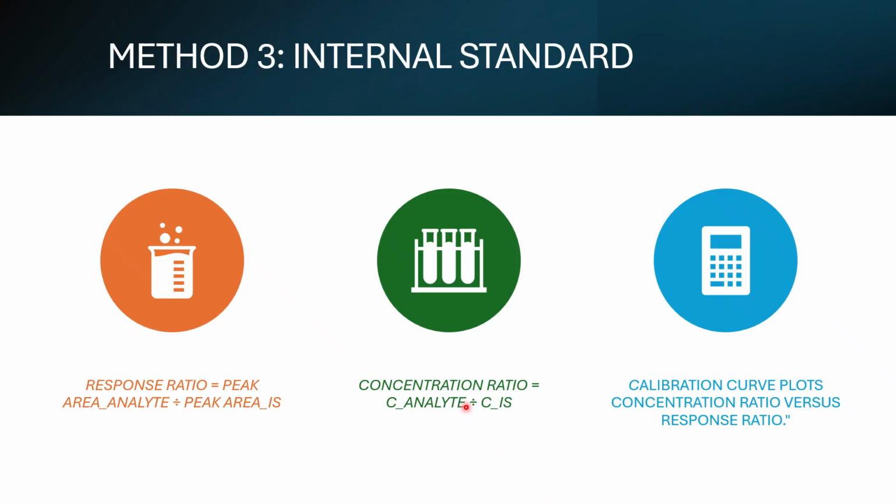So the concentration ratio is equal to the concentration of analyte divided by the concentration of IS. So your calibration curve plots concentration ratio versus the response ratio.